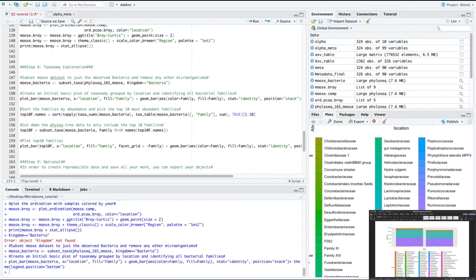So you can see whether or not they differ or they stay the same. Overall, in the east it seems like they have more of a bacterial load than the west, because they have abundances that go past this mark here, whereas the west barely does. So it's a good assessment.